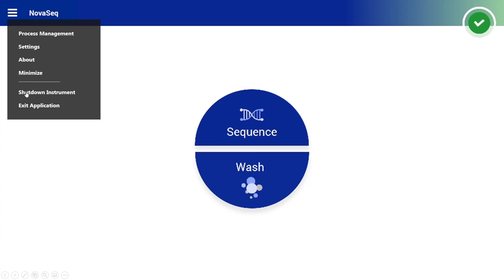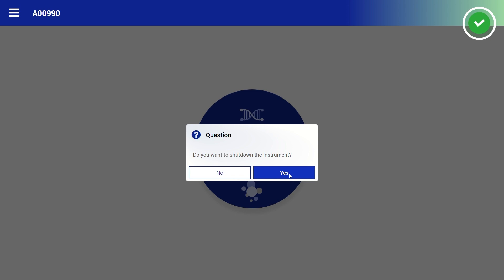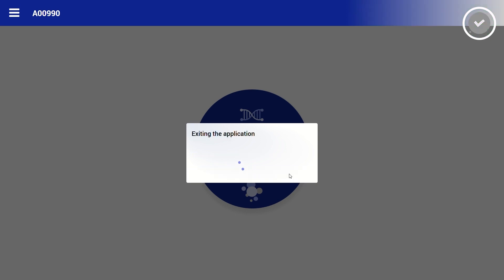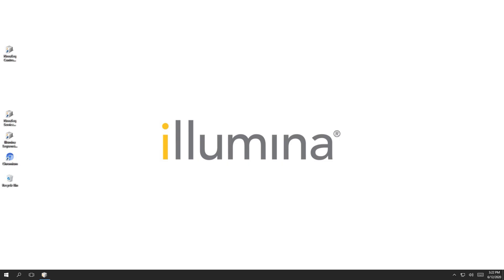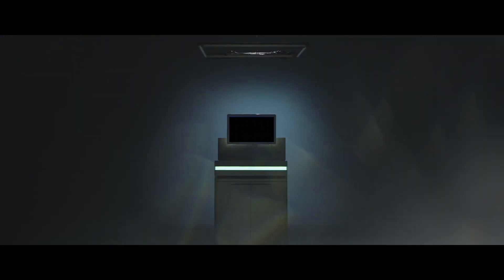Before performing the system check, power cycle the instrument. This will help to reset internal instrument communications.